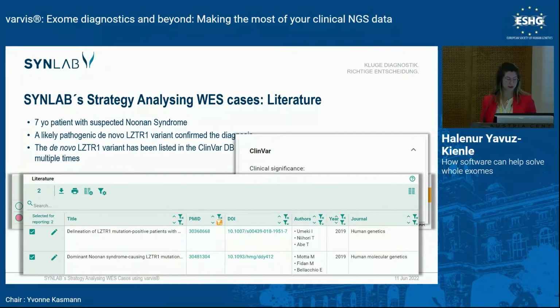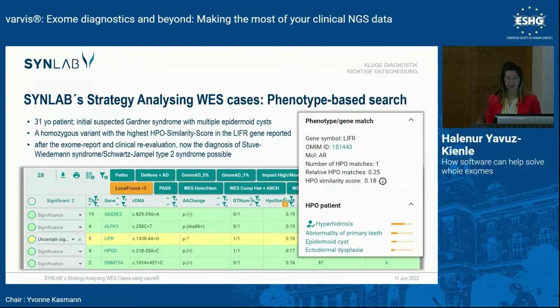Like I initially mentioned, you can then enter which PMID exactly describes this variant for Noonan syndrome. If this variant were not described in the literature, maybe the neighboring amino acids have been described before, and you can still leave your comment on the given PMID for the neighboring variants. So it doesn't have to be for the variant, but for the gene, you can also document it in your case.